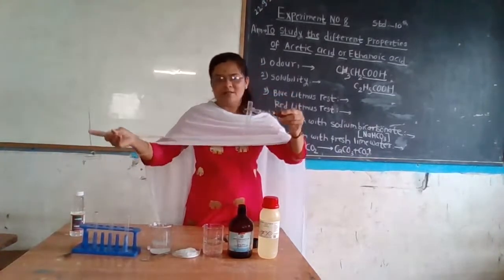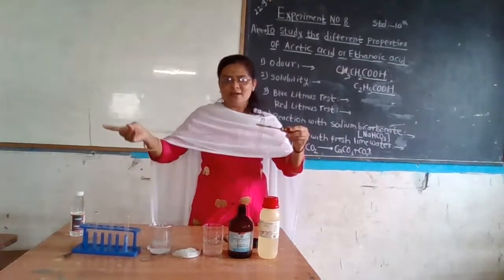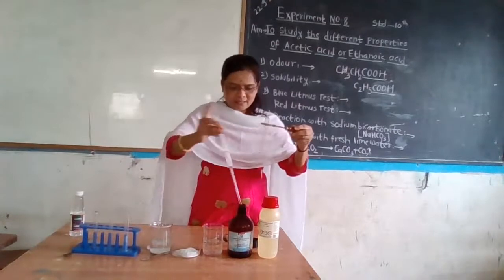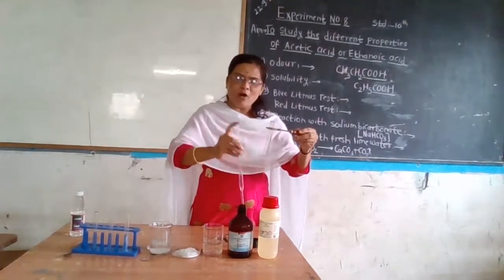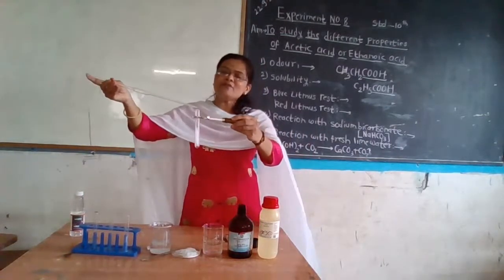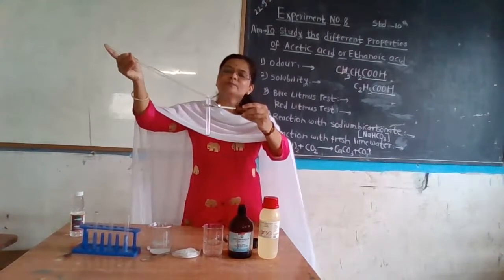See, this is the pipette. Whenever there is an acid solution, we have to use a pipette to avoid inhaling the acid. I am taking a few drops of acetic acid in the test tube.